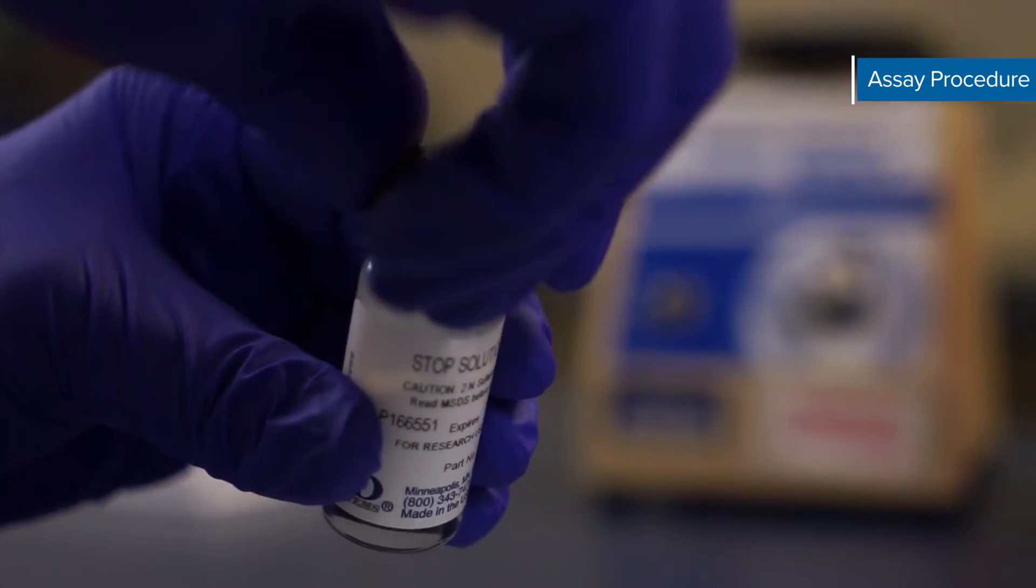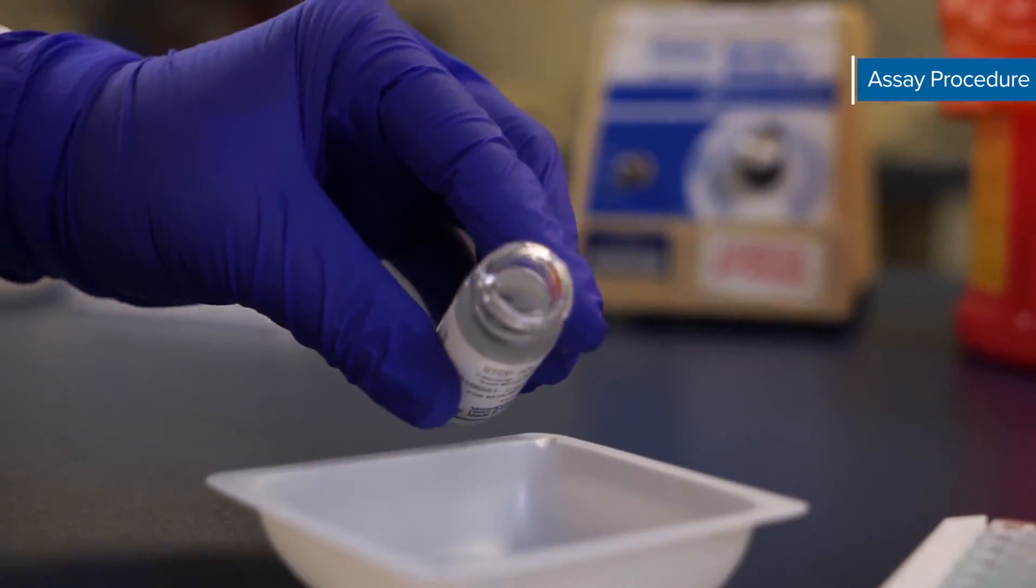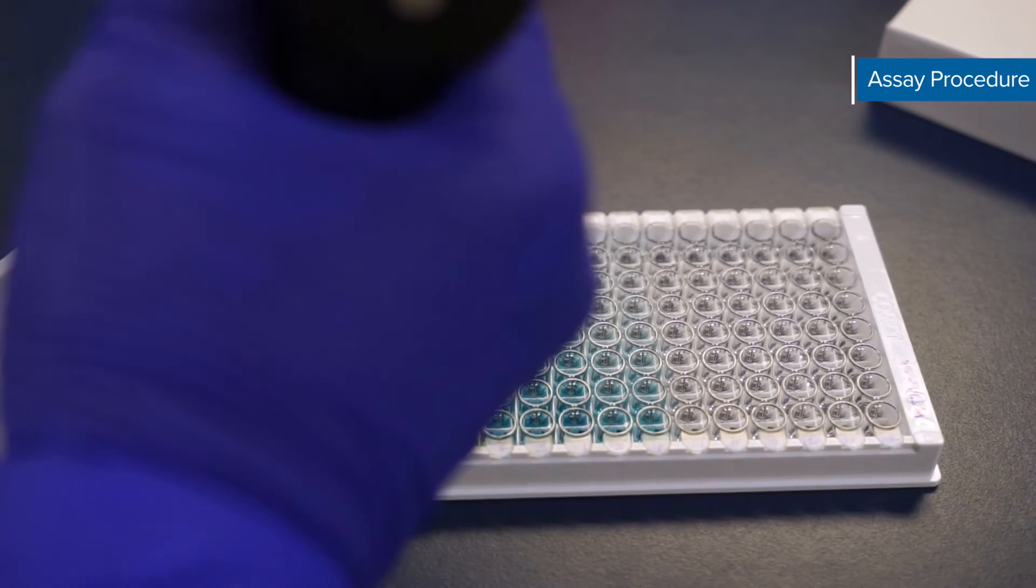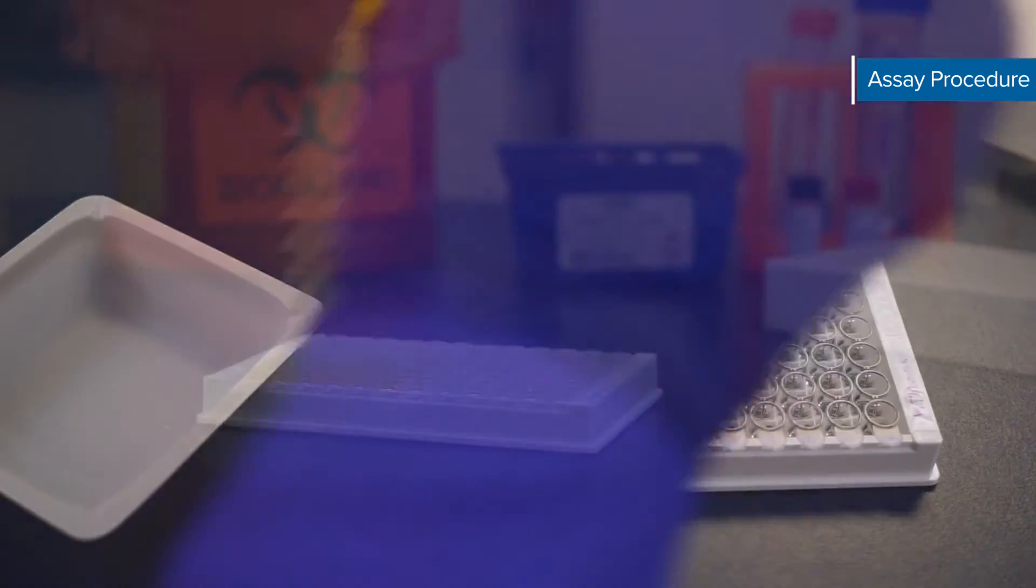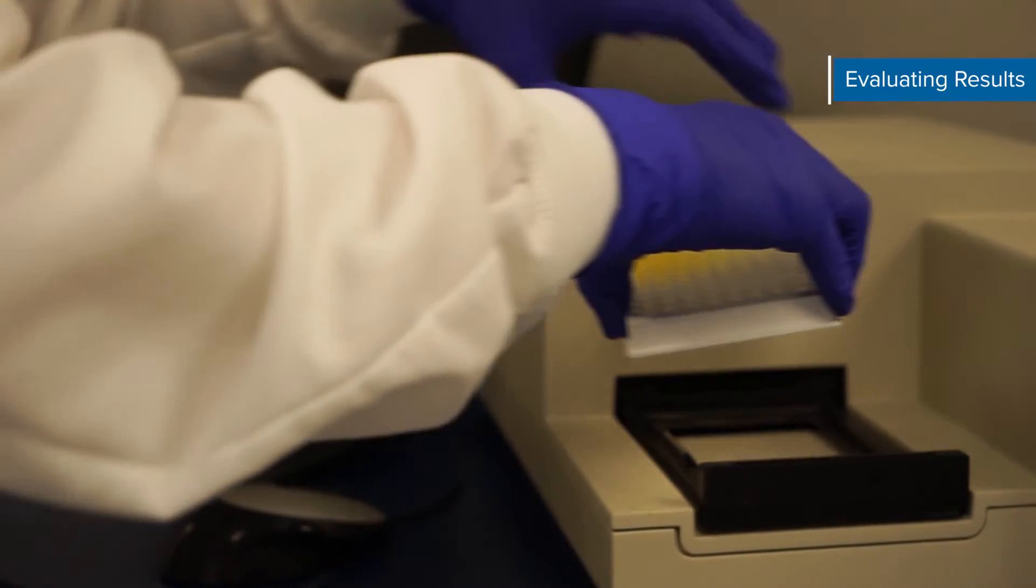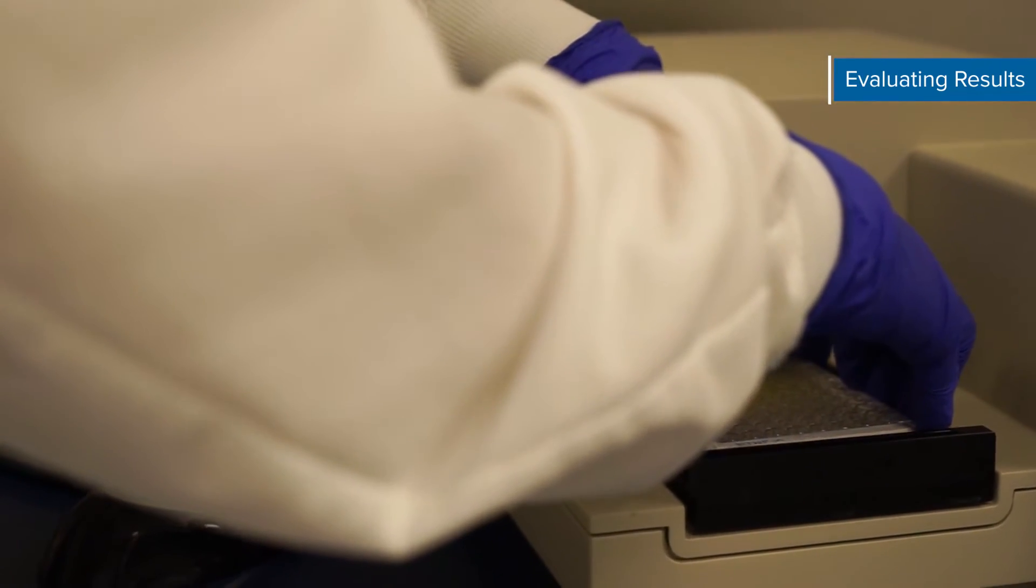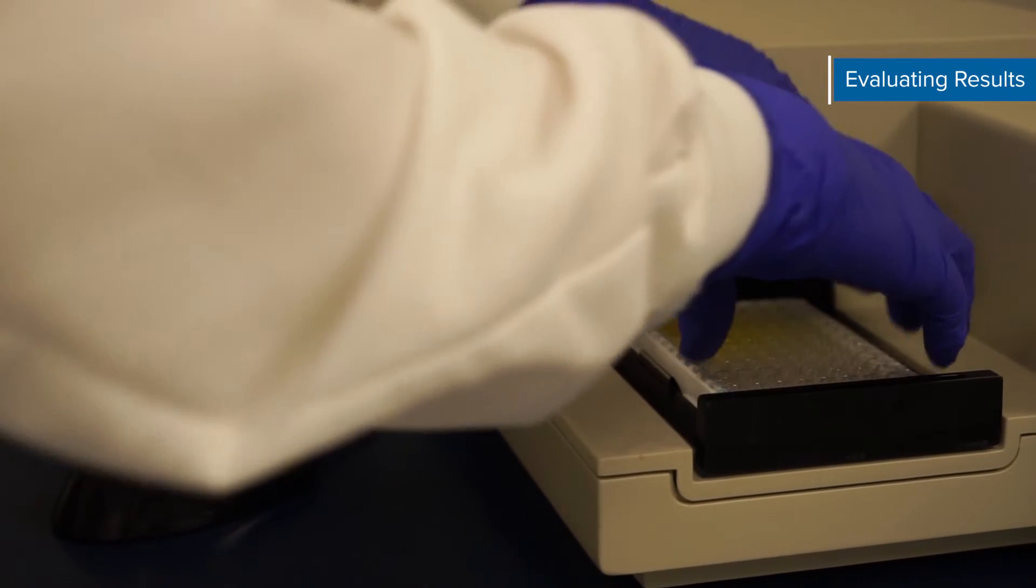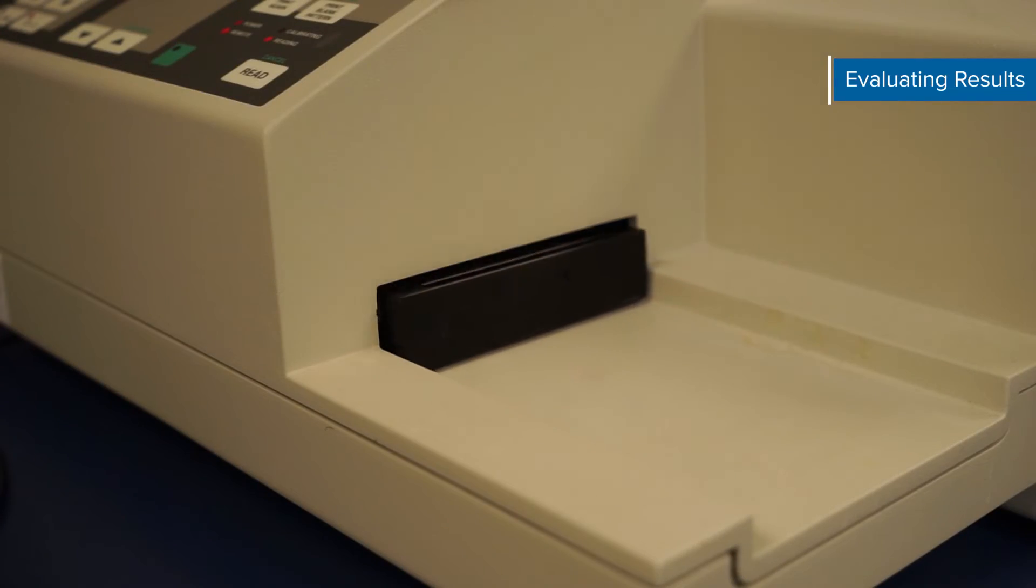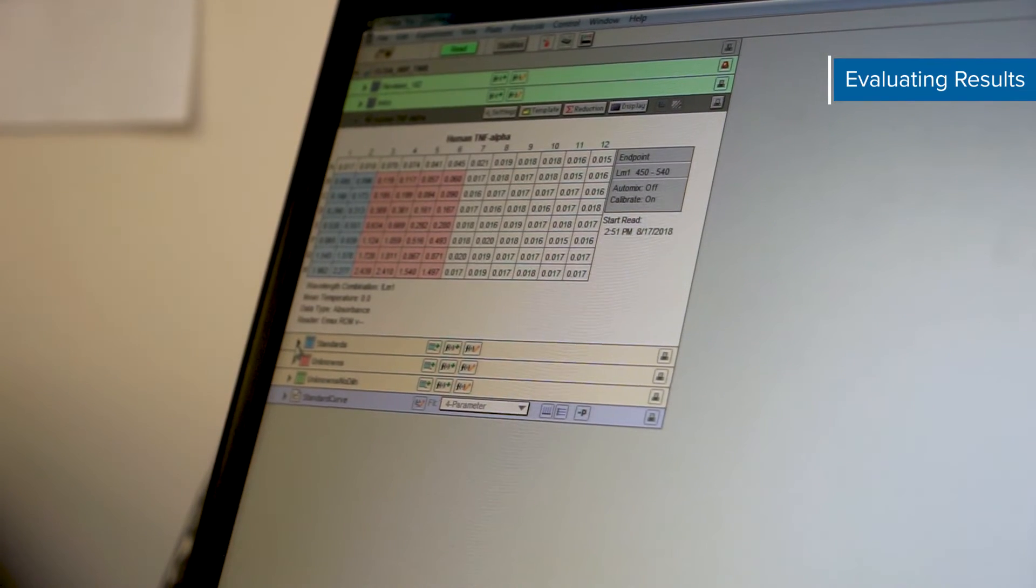Finally add 50 microliters of stop solution by quickly dispensing it into each well. Gently tap the plate to ensure thorough mixing. Read the optical density of each well immediately using a microplate reader set to 450 nanometers. If wavelength correction is available set it to 540 or 570 nanometers. This subtraction will correct for optical imperfections in the plate.